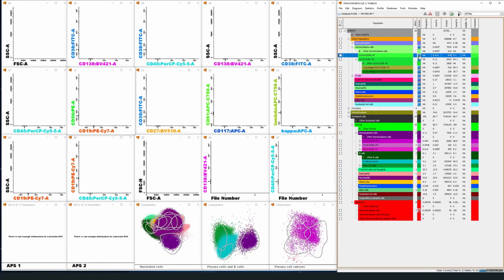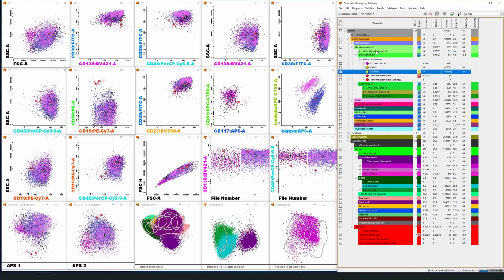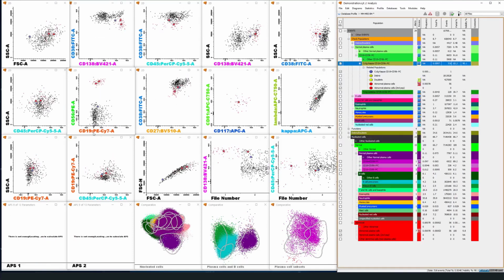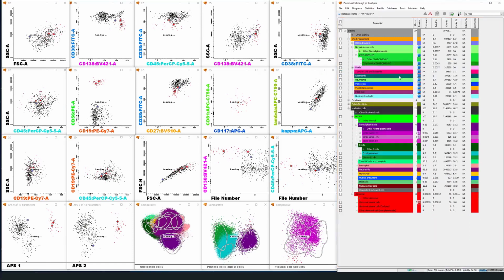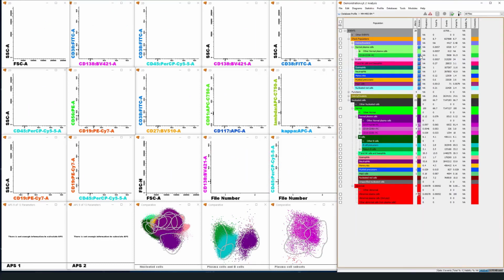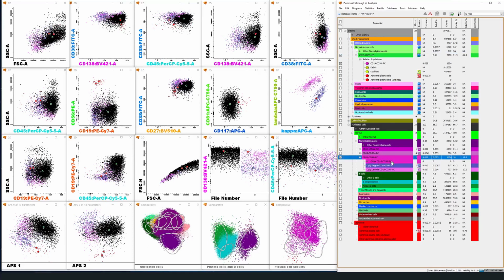And of course, from the first tube without kappa lambda, we see some doublets, which usually appear in a corner here, as a sort of higher side scatter population or in forward scatter, and they may be assigned to doublets. But they usually don't pose a big problem in analysis. And you have a double negative population as well, a part of which is kappa, and the rest is lambda. And we also have a population from the first tube. This looks like it's mostly CD19 positive, so I'll assign it to that. Sometimes those things can get misplaced by automatic analysis, but it's usually not the biggest problem.